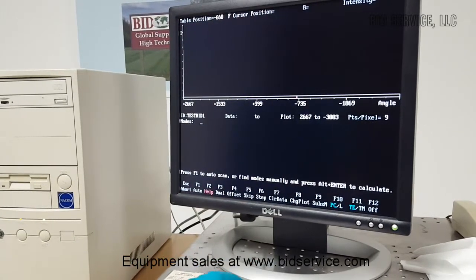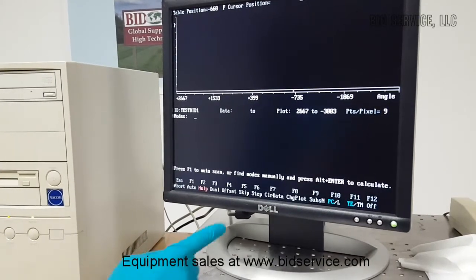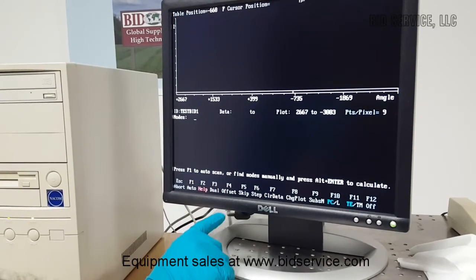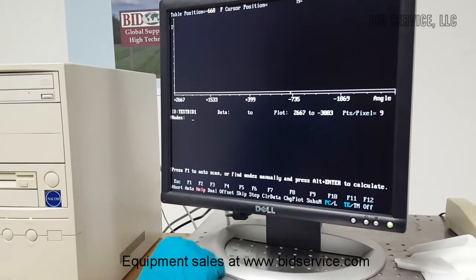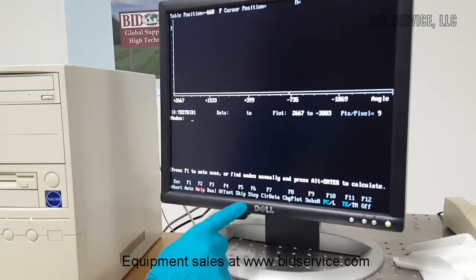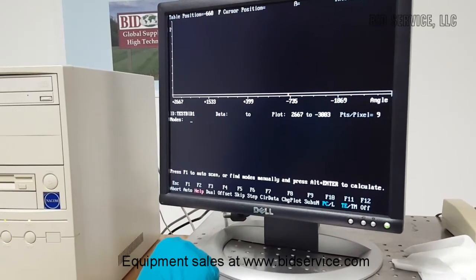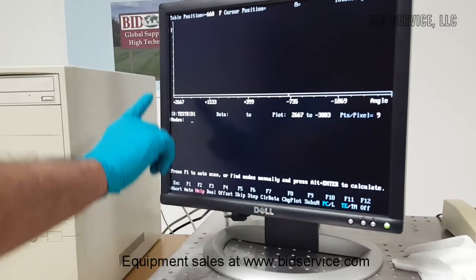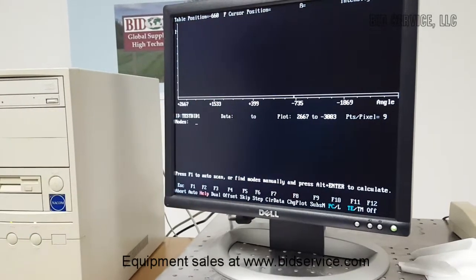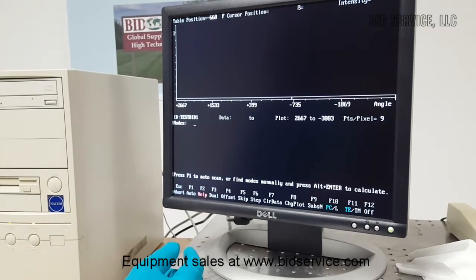The dual films option can be selected by F3. And there are options to enter an offset, skip a mode, or step to the next mode. Then clear data is to clear the data if the desired data is not achieved. And then change plot is to change the beginning and the end of the scan, that is the start and stop.